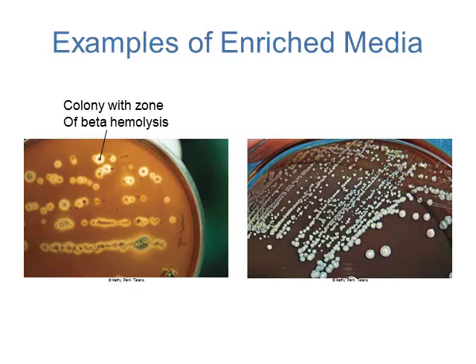Other species of bacteria do not destroy red blood cells, and that's shown in the image on the right-hand side. These bacteria produce colonies, they can grow, but they don't have a clearing around the colonies that shows hemolysis.